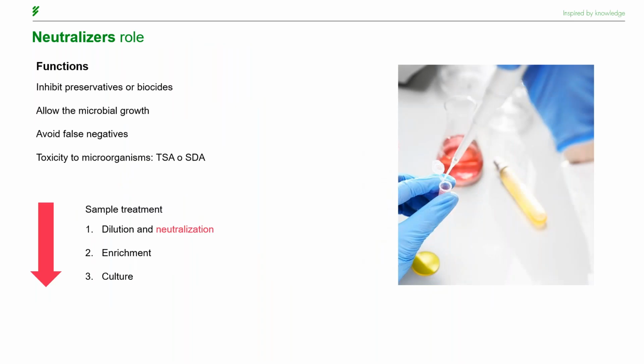And as in any other final product quality control analysis, for cosmetic samples, we must also use a medium to dilute or enrich the sample to be analyzed. However, the preservatives present in the formulation can cause problems in our results, since, as we've seen before, they would prevent the development of the microorganisms present, and thus we would obtain false negatives.